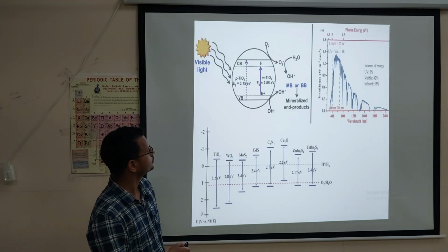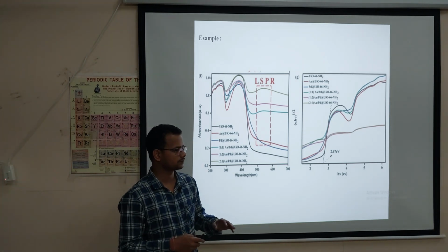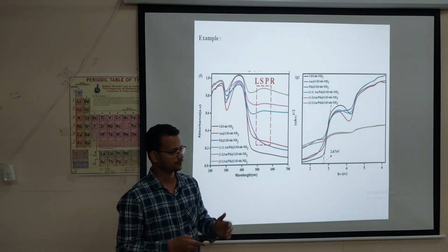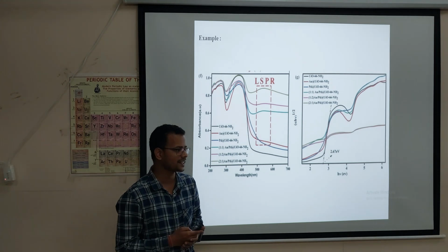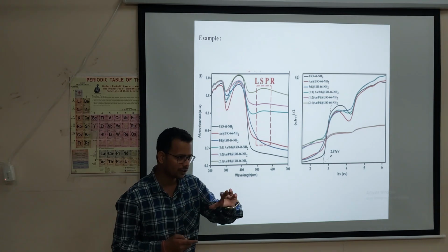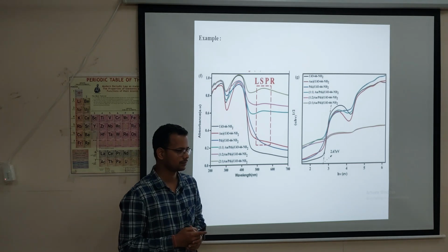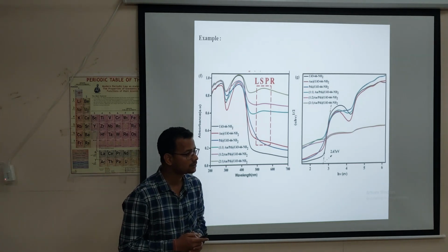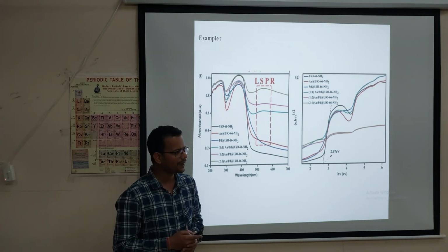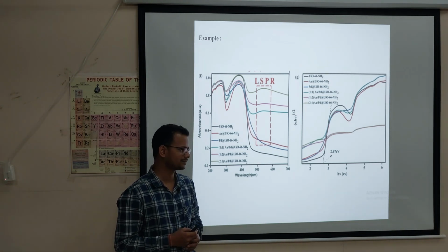Which one? Here, the peak position. Actually, I am explaining that one. In some cases you will get a very sharp, intense peak. In some cases, we will get a less intense peak. If a material is clear, we will get an intense peak. After gold palladium loading, the material gets rough. So in that case, it might not be possible to get a very sharp peak. Clear or not?